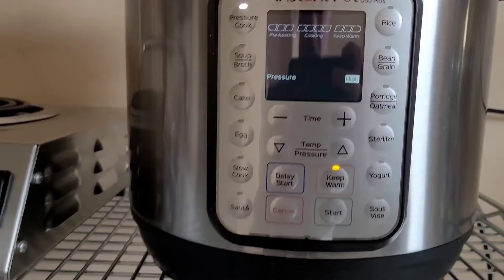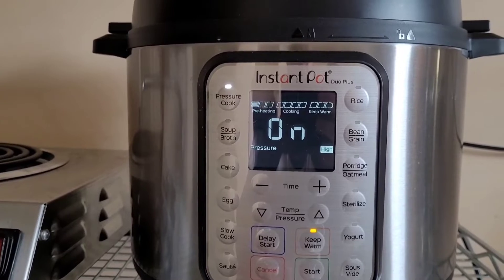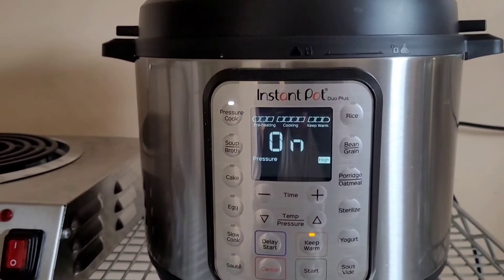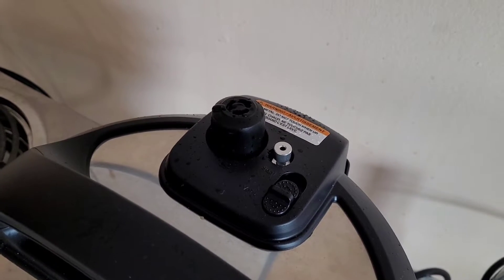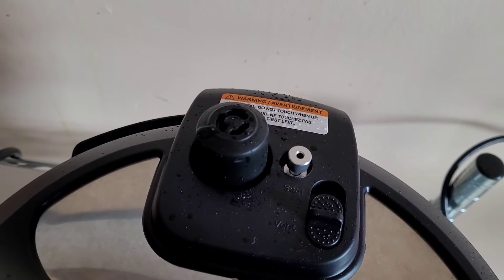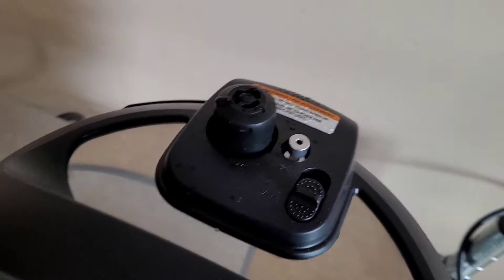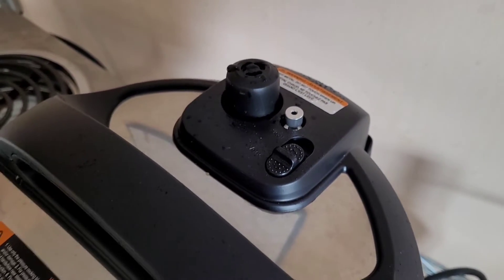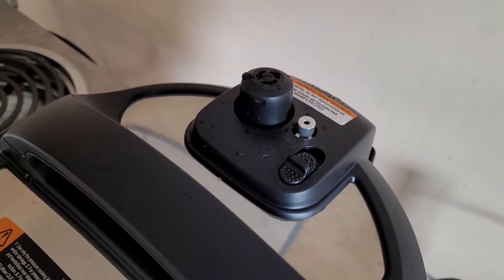We're going to set it to 90 minutes and do a 10-minute vent on this as always. You can hear the trapped gases, the trapped pockets of cold air being vented out of this valve here. That's exactly what we're trying to get rid of while venting — we want to make sure the trapped cold air pockets have been removed and replaced with steam.